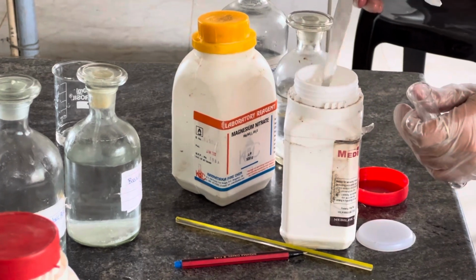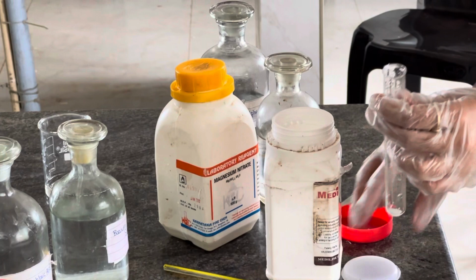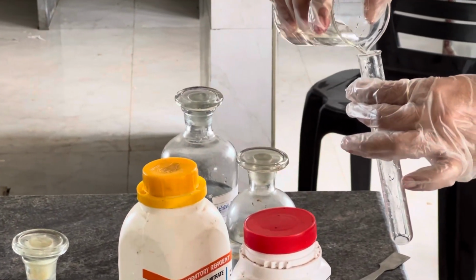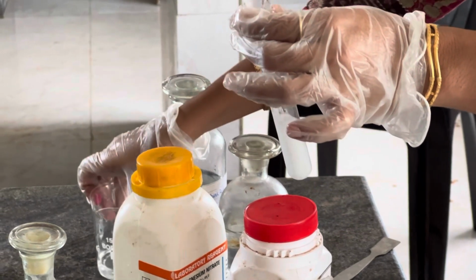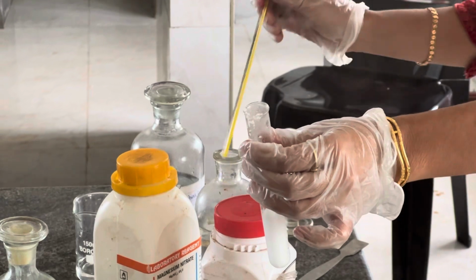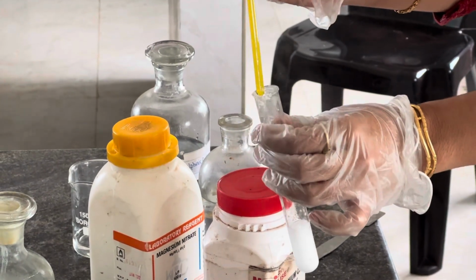Again, let me test one more salt. Here I have taken a pinch of another salt in a test tube and add concentrated sulfuric acid to it. When we add concentrated sulfuric acid, you can observe the presence of dense white fumes. As soon as I add the concentrated sulfuric acid, there are dense white fumes, right? Now put a glass rod, dip it in ammonium hydroxide and place it at the mouth of the test tube. When I place it at the mouth of the test tube, again you can clearly observe dense white fumes. That confirms the presence of chloride. So here the salt present is a chloride.